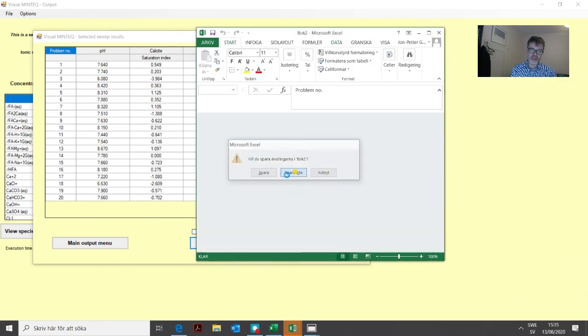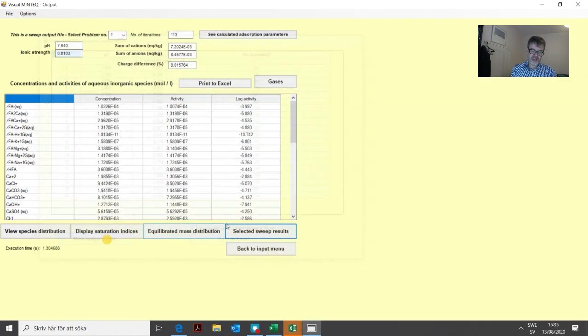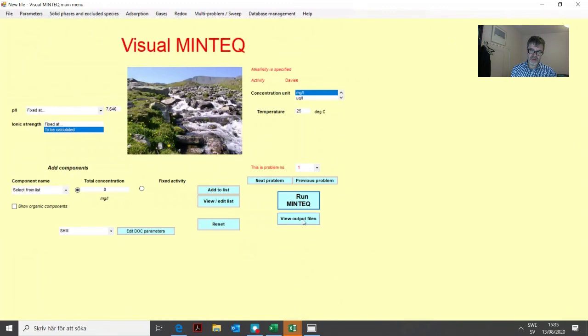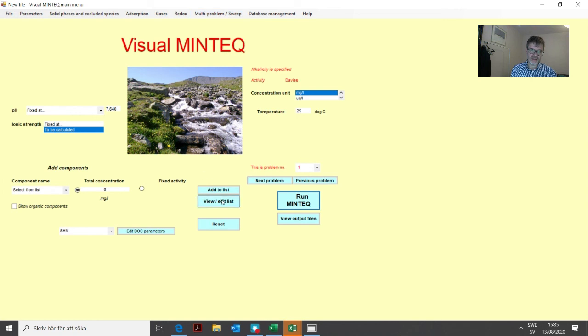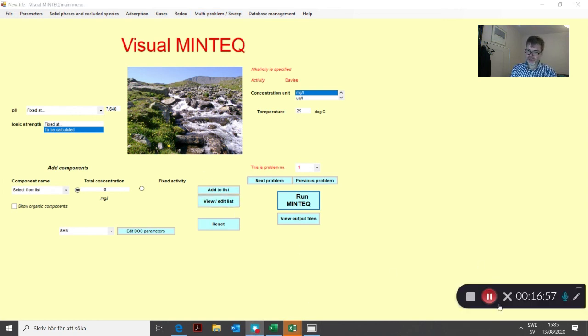That was two simple examples demonstrating how to use these different options in the multi-problem sweep menu. That was all for this lesson. Thank you very much for now.